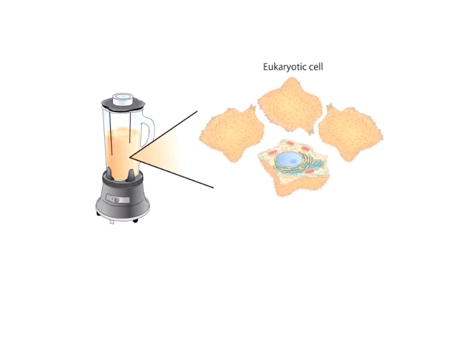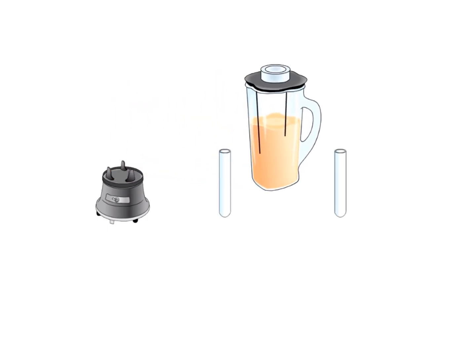In this session, we are going to understand subcellular fractionation and gradient centrifugation. In subcellular fractionation, cells are disrupted and their components are isolated into relatively homogeneous fractions. The first step in subcellular fractionation is breaking the plasma membrane. A high-speed blender can break the plasma membrane and endoplasmic reticulum into small fragments while leaving nuclei, mitochondria, and other organelles intact.